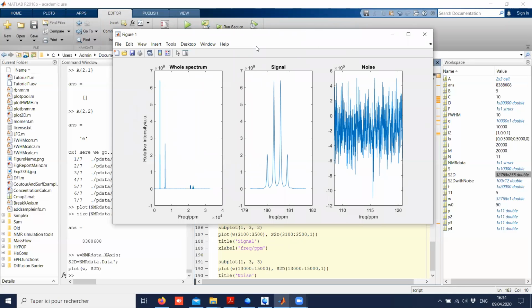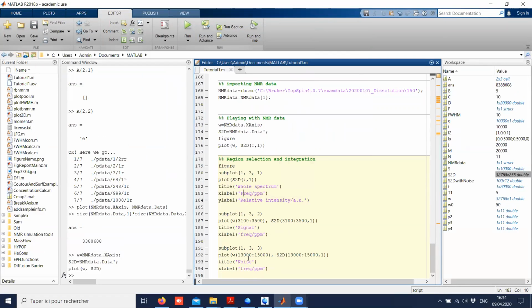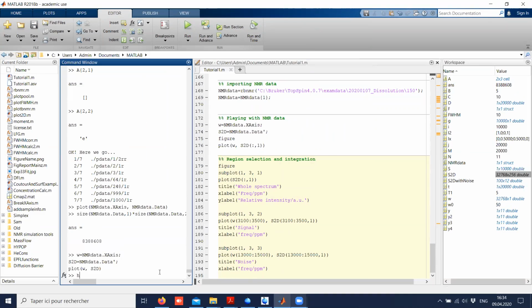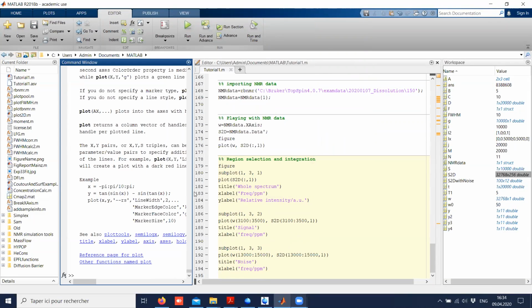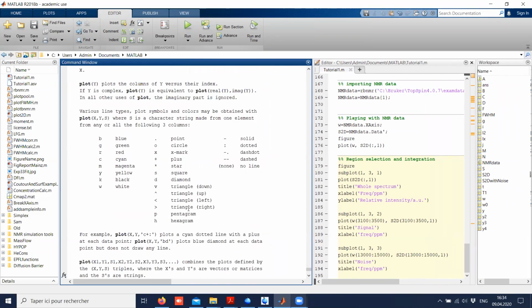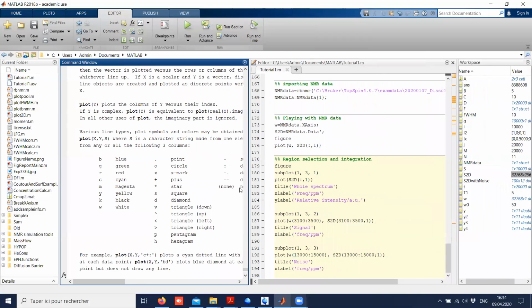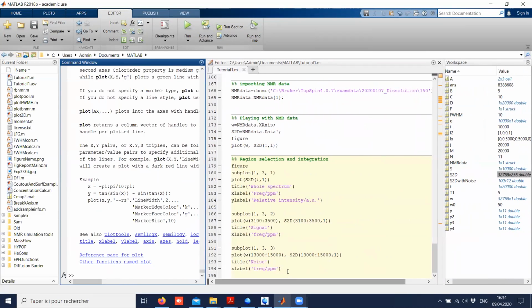There are many ways to play with this. With graphs, there are loads of things you can do, and it's useful to refer to help plots, and then you can read a little part of what you can do, but there's really a lot. And if you ask on Google, there's really a lot of information. It's quite easy to find. People give you advice on this.